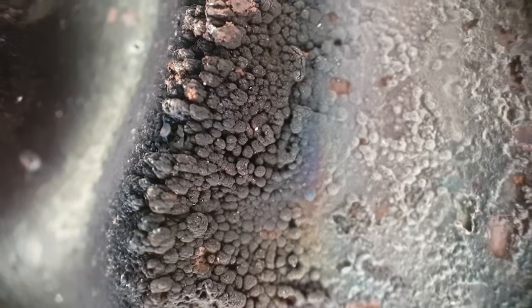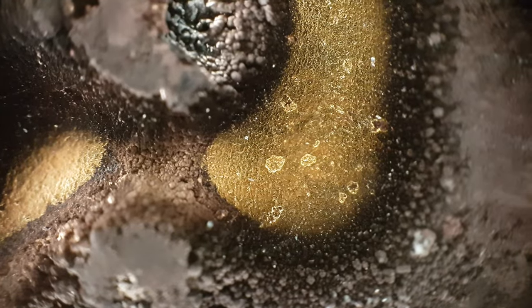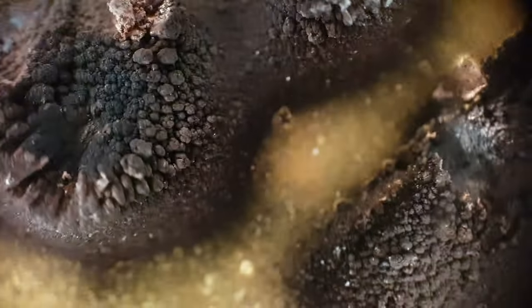Because if it was the actual material that appears to be kind of created or deposited, it wouldn't have this steep side and then fall off into the plateau. It would be like a curve onto the surface, wetted onto the surface. Now you can see where the material is removed here. And I believe this is because it's quite brittle and a bit sandy, in fact, which might give us an indication as to what it's made of, maybe. Don't know.